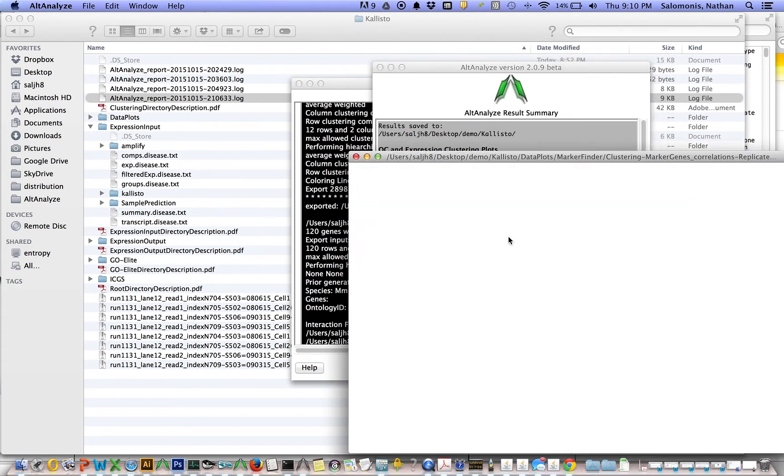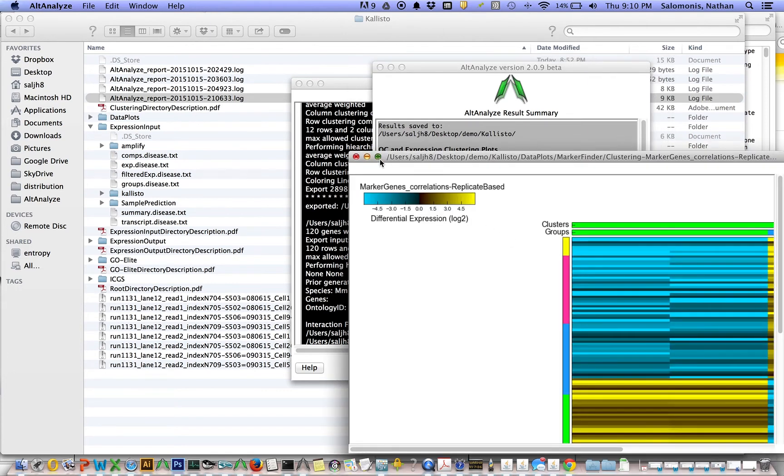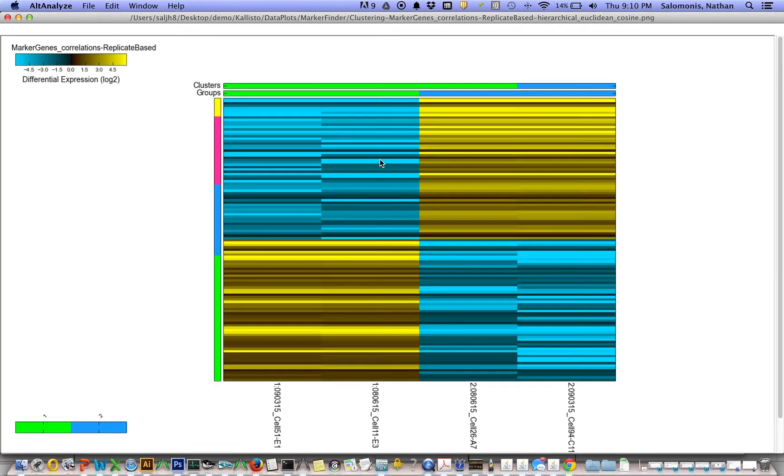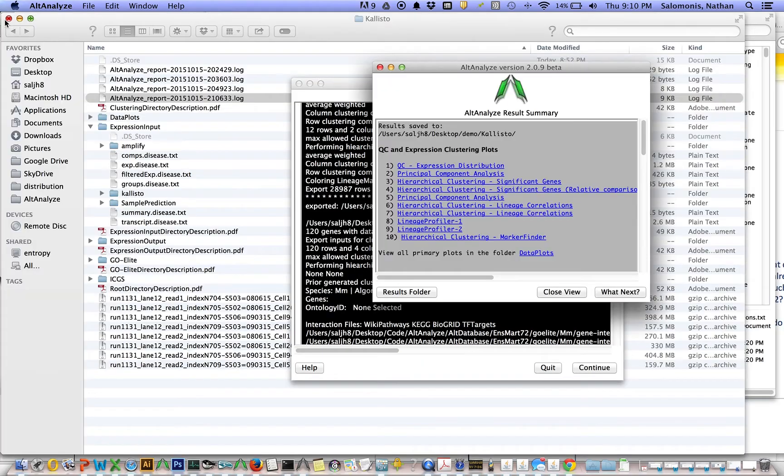There are also something called marker finder results. These are the genes that had the best described expression restricted to either group 1 or group 2 in our analysis.